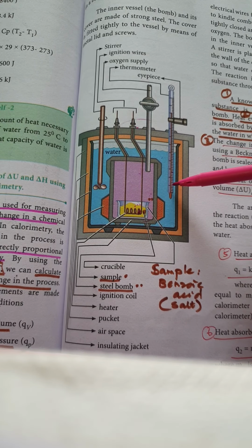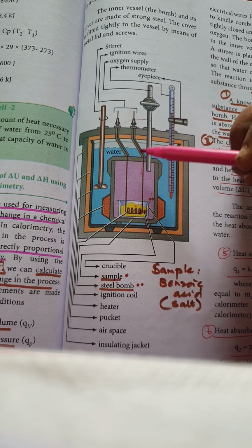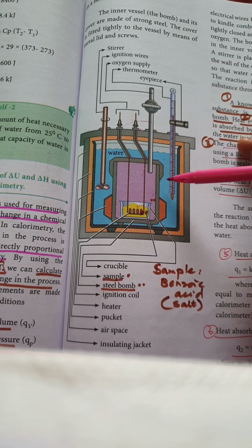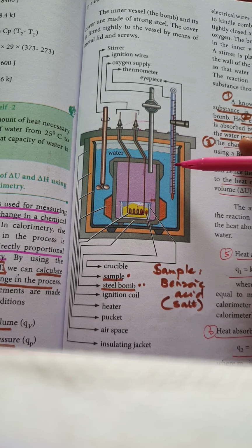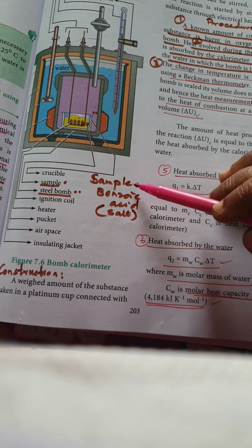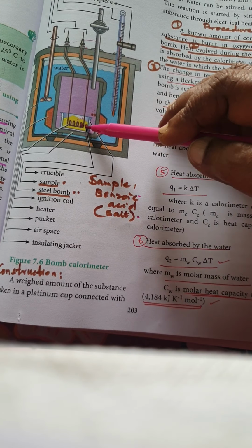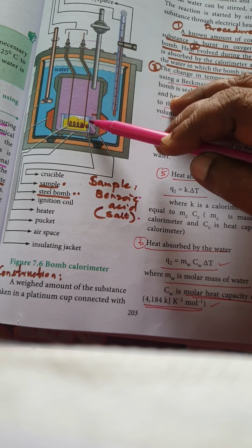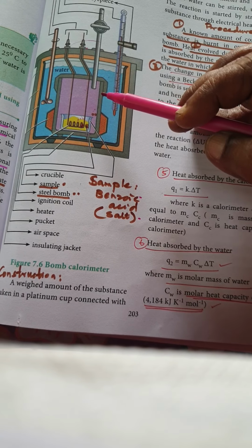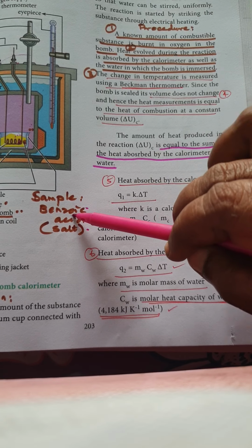Before this combustion reaction, the temperature of this whole system, which is immersed in water, is measured. That's the initial temperature. Now when it burns, it gives out heat, and that heat is dissipated using a stirrer into the water, and the temperature of the water rises, so the final temperature after combustion can also be measured. The sample under study here is benzoic acid, which is in a solid state. So the benzoic acid can be used for the measurement of the delta U and delta H values.